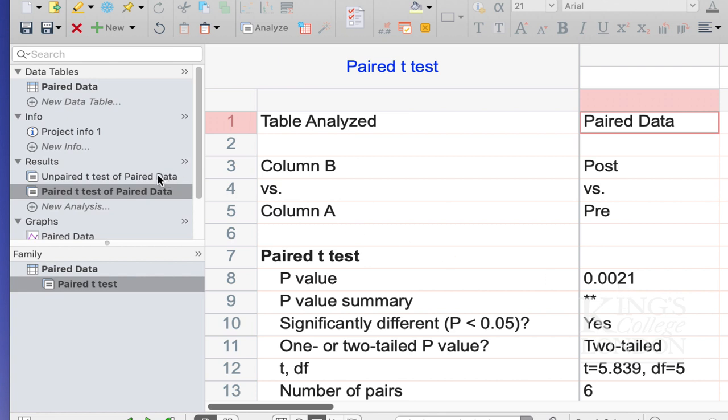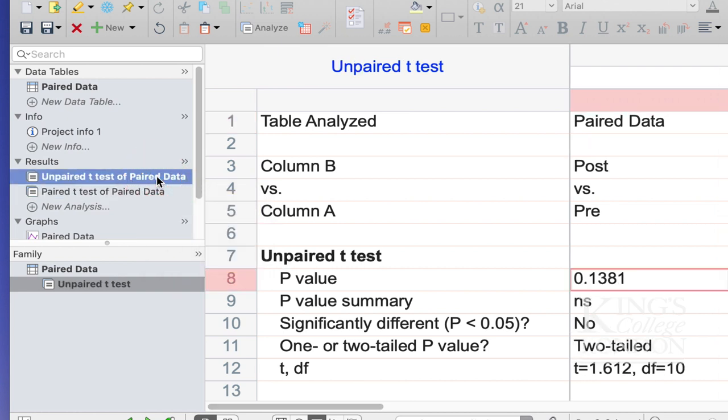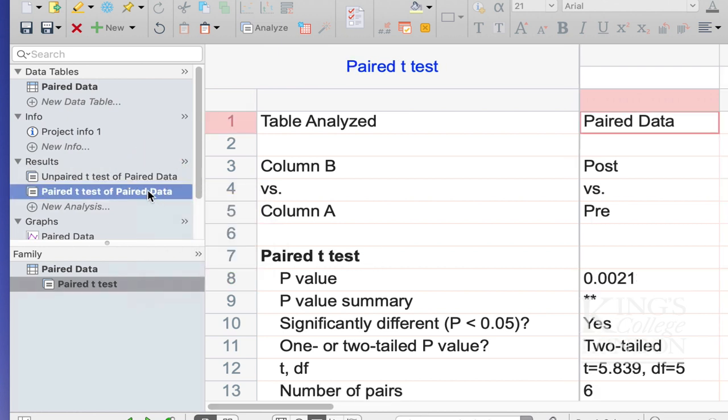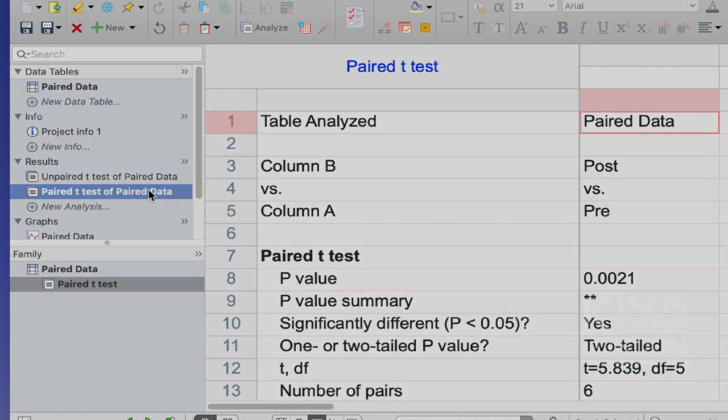When we compare this to our unpaired test, we'll see the difference in p-value. And that's because this time round, we've done the correct analyses, and we've used a paired test to compare paired data.